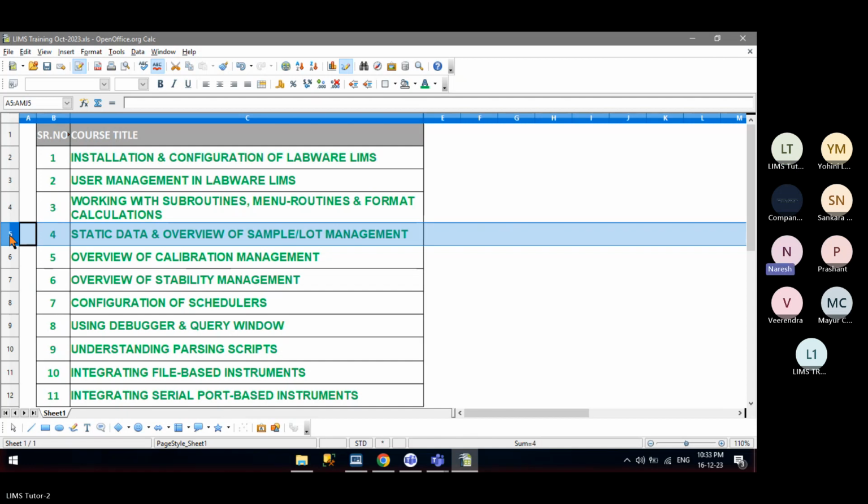So may I know, we have two trainings, I think, LIMS administrator and LIMS basic, right? LIMS administration and IT administration, LIMS technical administration or IT administration, you can say. No, actually, I'm talking about the training sessions, basics and admin, our schedule.